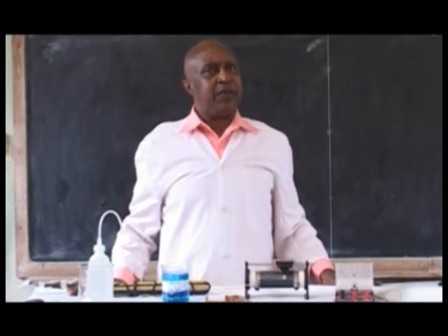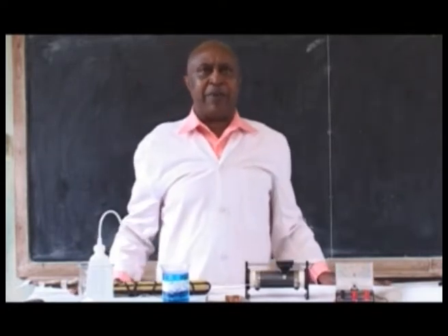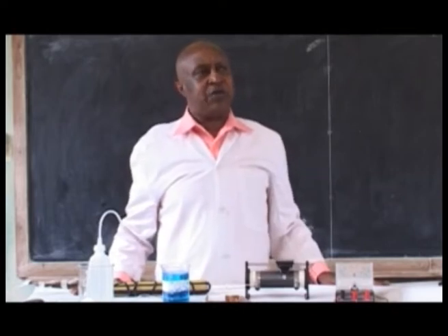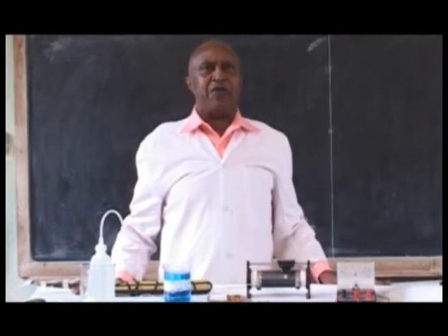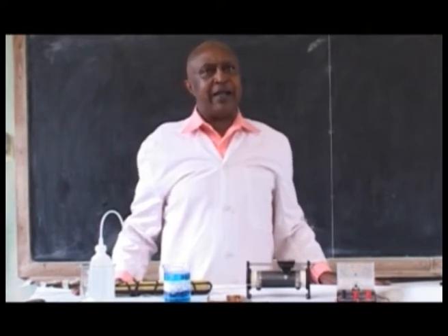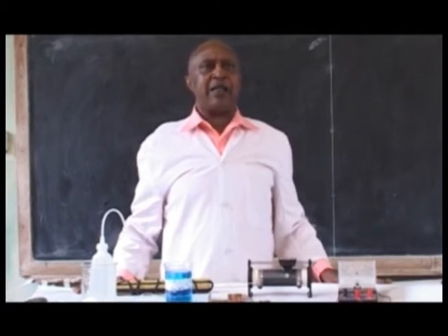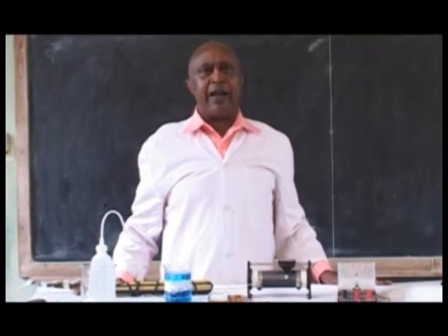The relationship between the quantity of electricity supplied and the masses or volumes of products formed during electrolysis was studied by Michael Faraday, and he summarized his findings in the so-called Faraday's first law of electrolysis.